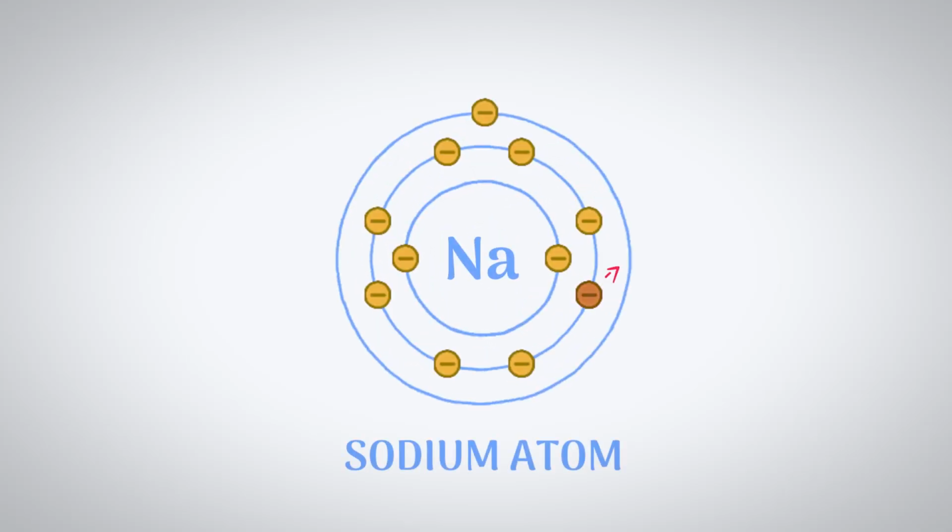So how an electron microscope works is that for an electron microscope, we need a beam of electrons. An electron is extremely lightweight. It's negatively charged. It can either be bound to an atom or it can be free-flowing. There are a lot of manipulations required for an electron microscope to do its job right.